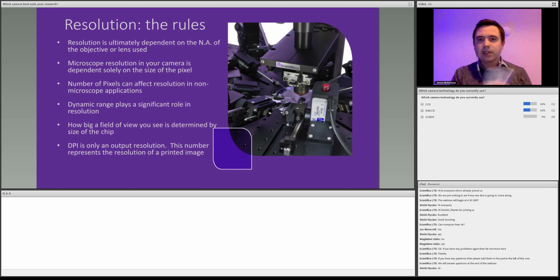It does if you were to take, say, a camera on a phone, because I can take a picture of you from here. Not that I can see anyone, but if I was actually in a room, take a picture of you from here. I think this might have 8 million pixels, and so the screen I'm pointing this camera at is spread over those 8 million pixels. Now, if I move it closer, then I can take a picture much closer, and each of those 8 million pixels has a lot more detail that it can visualize because you're moving closer.